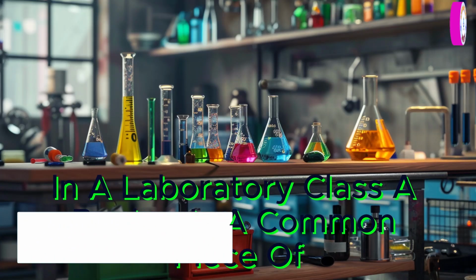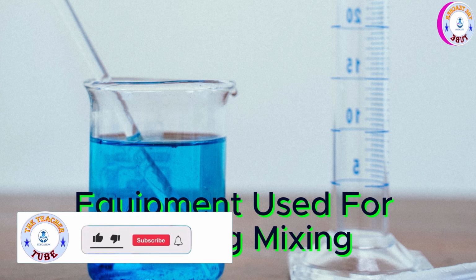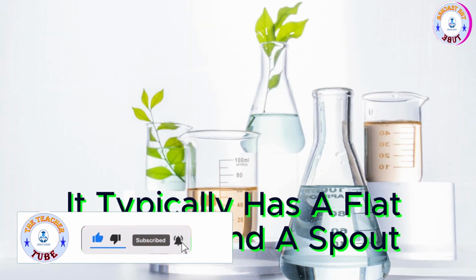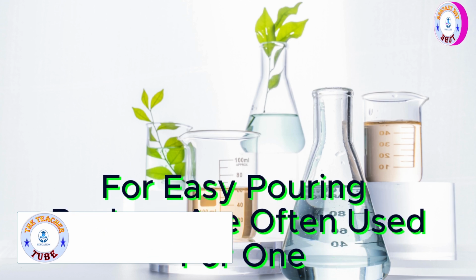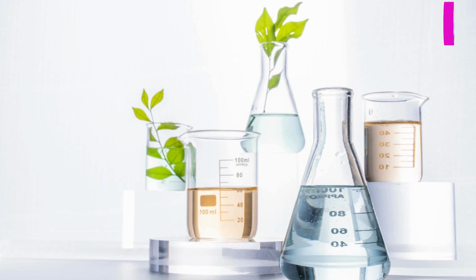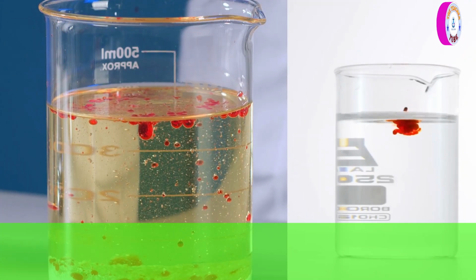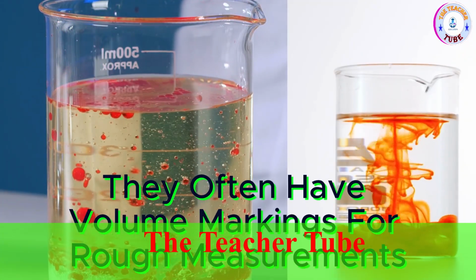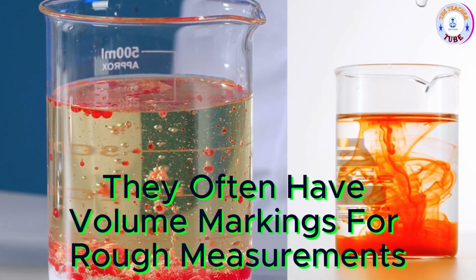In a laboratory class, a beaker is a common piece of equipment used for holding, mixing, heating, or stirring liquids. It typically has a flat bottom and a spout for easy pouring. Beakers are often used for: 1. Measuring liquids. While beakers are not as precise as graduated cylinders, they often have volume markings for rough measurements.